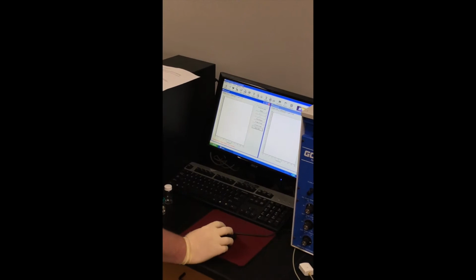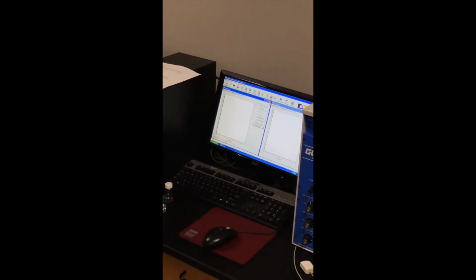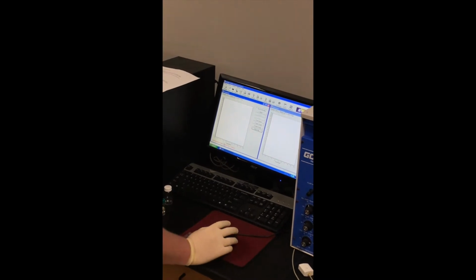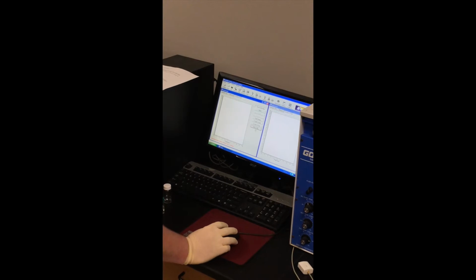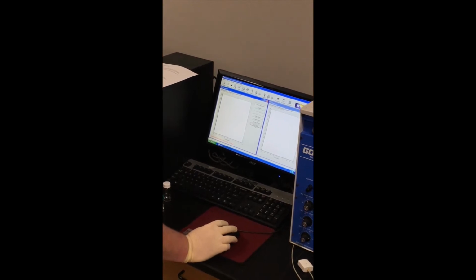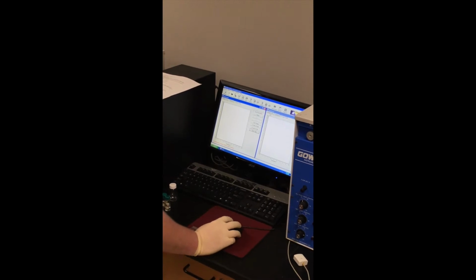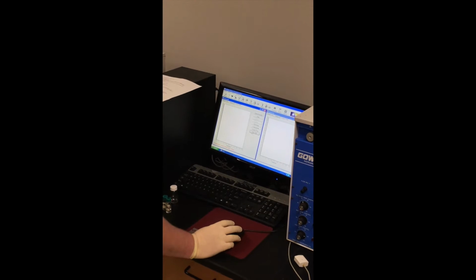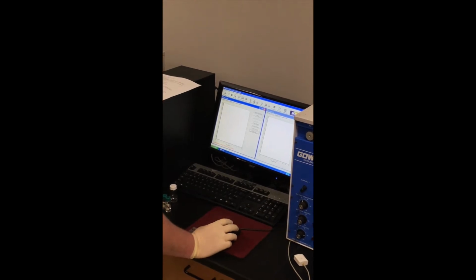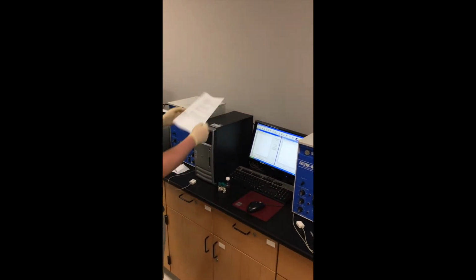When this is on, this number down here will appear and start updating. In this case, it's already been checked. We checked the baseline a minute ago, so it's already been adjusted, but we'll pretend that it's not. It's updating, so we'll hit 0 adjust to re-zero it down to the center. Once it's ready to go, we uncheck check baseline and make it look like a regular button. When you've done this, it stops updating the numbers, and it's ready to go. On this page, you are now all the way down to sample run.